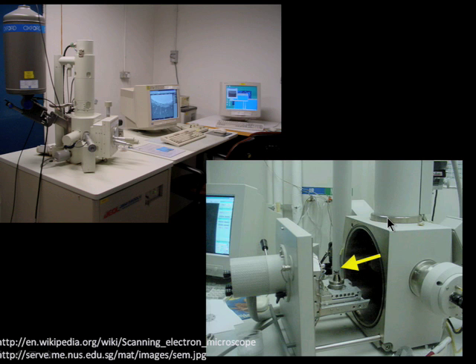So if you have something that's a polymer sample, you can image it using an electron microscope, but you need to coat it with metal, and that can affect the resolution you can achieve if you need to, for example, coat it with a metal that's tens of nanometers thick, and then you won't be able to see features that are smaller than that.